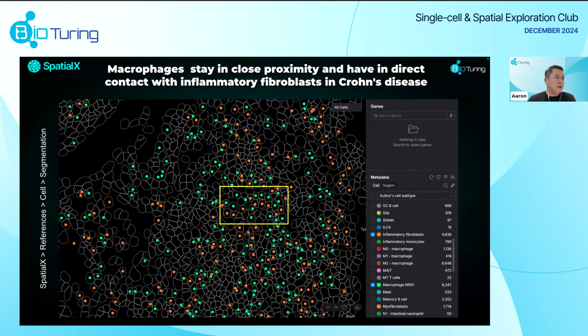You can see here the same, green for macrophage and orange for inflammatory fibroblast. And you can see these two cells stay in close proximity to each other. If you focus on some particular area here, you can see the inflammatory fibroblast just stays next to the macrophage, and they can form contact with each other, which is one of the information that we can use to validate that these two cells can interact with each other.